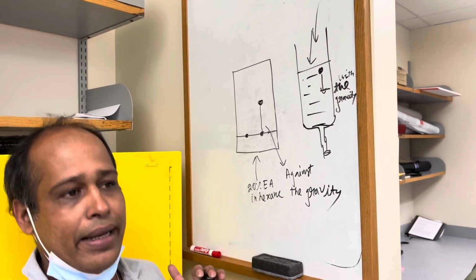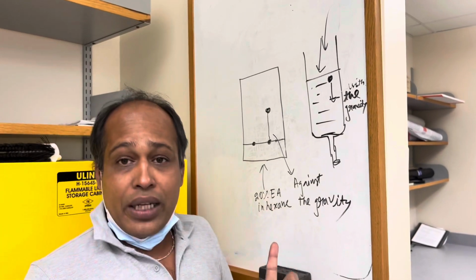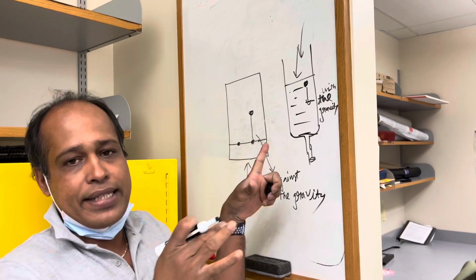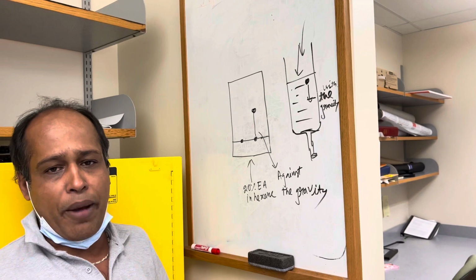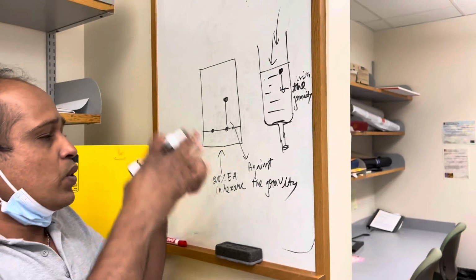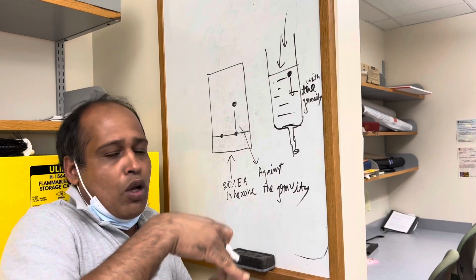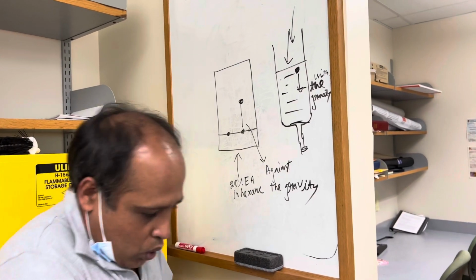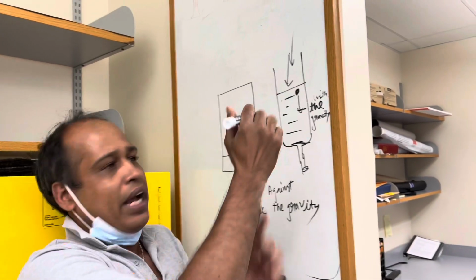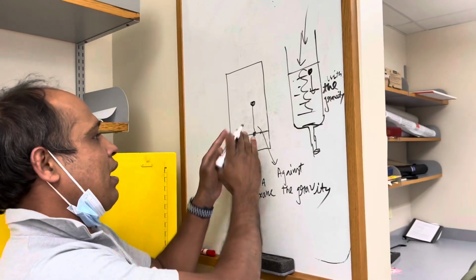It will pull up against the gravity, but not only that, the most important thing is the texture or formation of the silica. Here the silica is like two-dimensional, but here the silica is like three-dimensional, like a total round shape. So in that case, there is a term called solvent vortex or something. Its pathway could be different. It's not just linear. But here it could be linear.